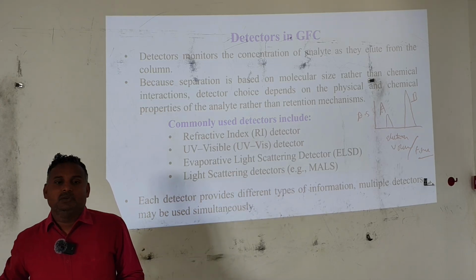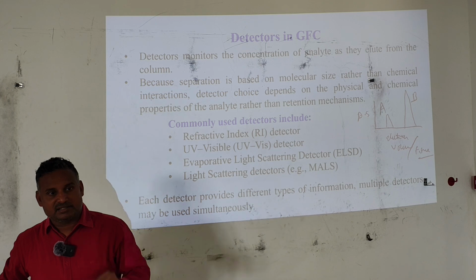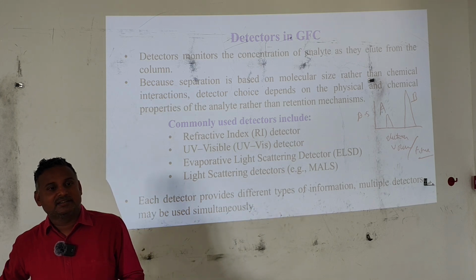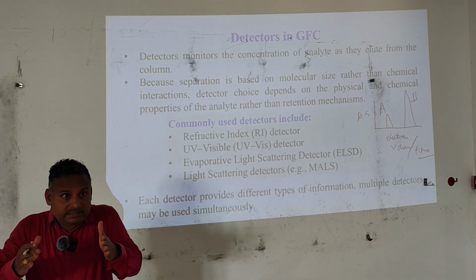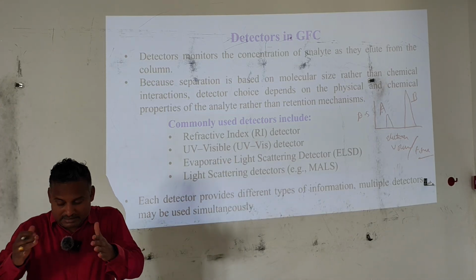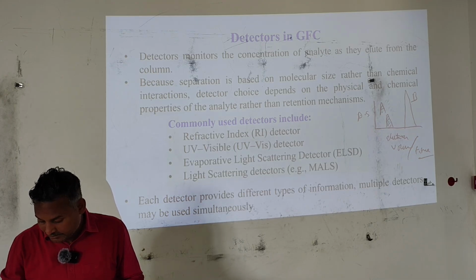B. Okay, your answer is right. B is having more concentration. Now justify your answer. Because it has detected signal which is higher than A. Okay. When you are saying detect the signal higher, it is both in terms of breadth and height. Breadth and height. That means it is a matter of peak area.